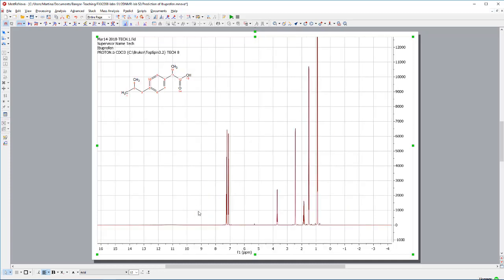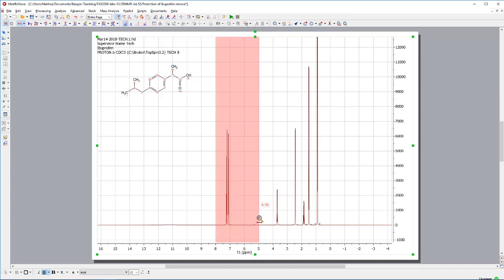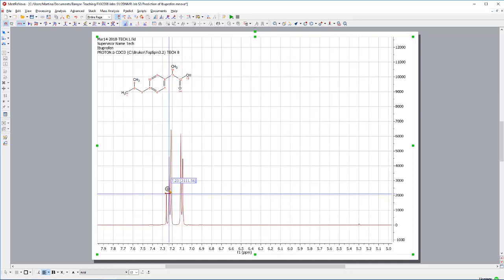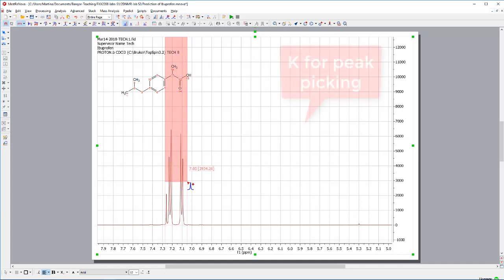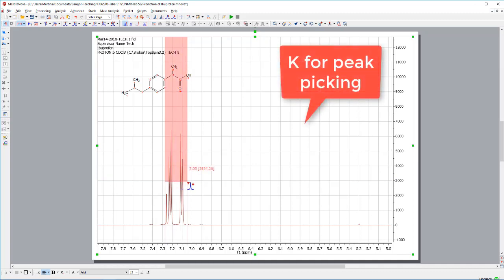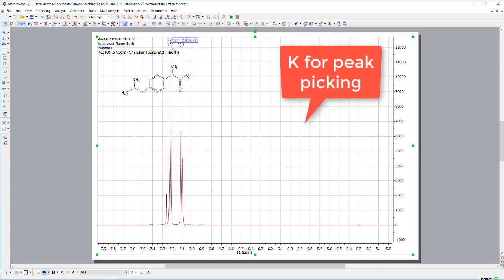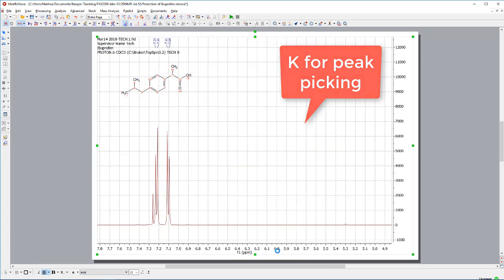The next thing I'd like to do is to do some peak picking. So, I zoom in my spectrum first of all again. Peak picking is pressing the letter K, that's an easy way, then holding down the left mouse button. And you can see here, we get our signals.